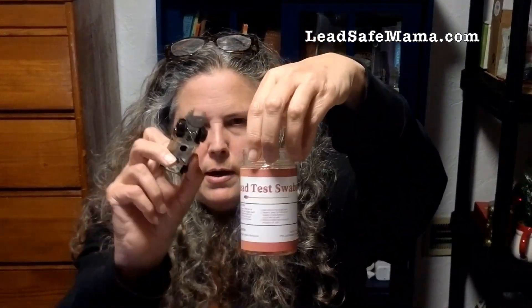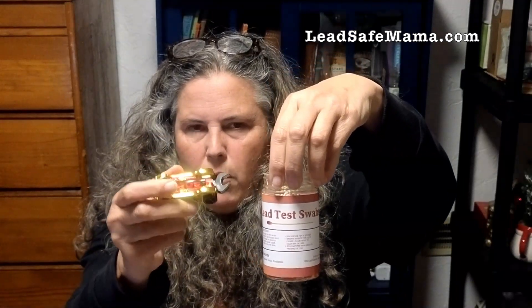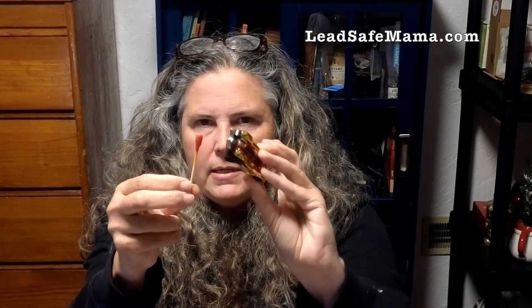These are bogus — they don't work. This is a lead-free toy car with a zinc substrate. I showed you the XRF testing, and this is what it looks like when you use one of these bogus test kits on a lead-free toy car. These are not to be used. You must stop using them. We need to get Amazon to stop selling them. They don't work and they are a waste of your money. Thanks for tuning in — learn more at LeadSafeMama.com.